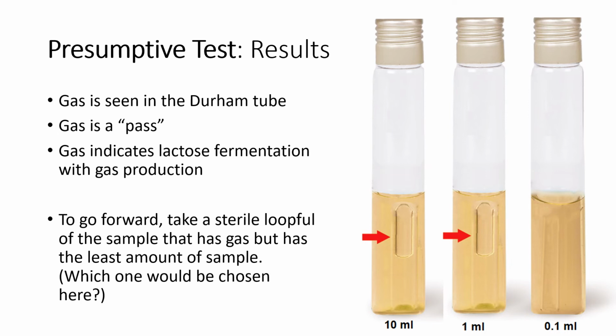Okay, so if we had done this in lab, some people would come in with their well water, hoping everything is fine. And all three tubes would have nothing, no gas in any of them. And you could leave and say with certainty that there's no E. coli and therefore no feces in that sample. Those people would be happiest of all. This is one of those tests you want to fail.